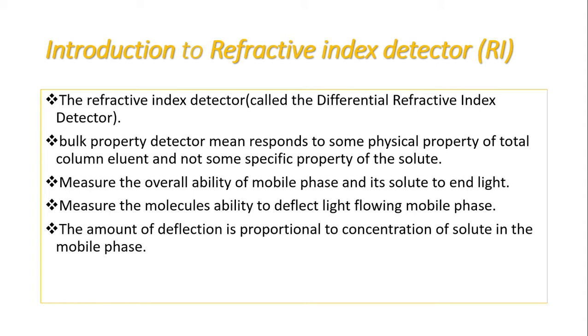We have a direct proportion between the amount of deflection and the concentration of solute. When the concentration of solutes in the mobile phase increases, the amount of deflection will increase. So it's a direct proportion.